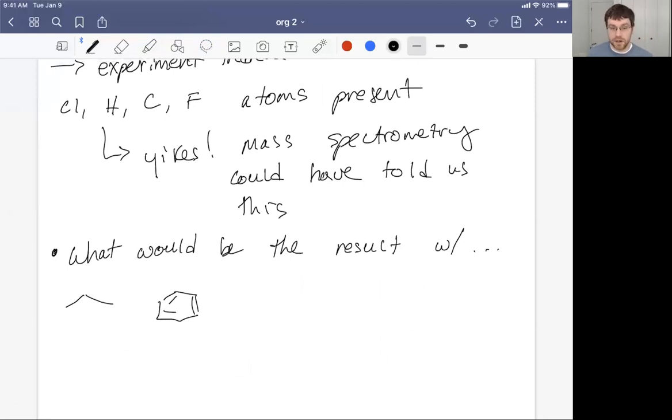Unequivocally, we could say that these are standard organic molecules, right? Propane, a fundamental hydrocarbon, benzene, which will comprise an entire unit within this class. Okay, so these should be fair game, right? If we're going to determine the structure of organic molecules using NMR, this has got to be able to differentiate between these two.